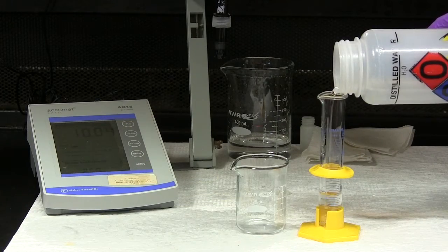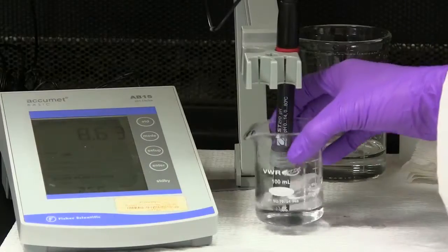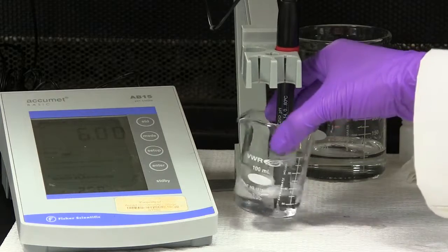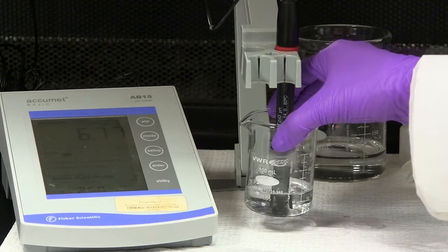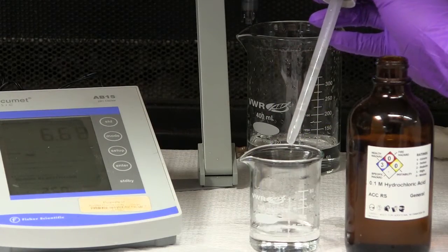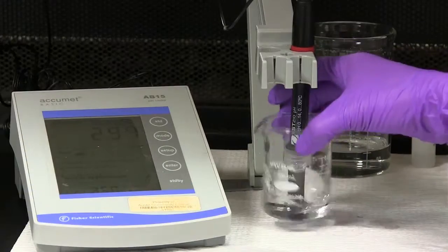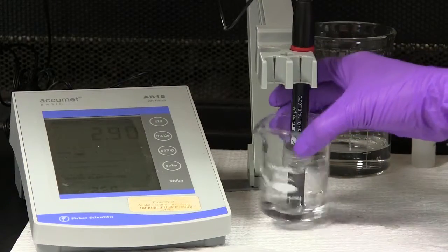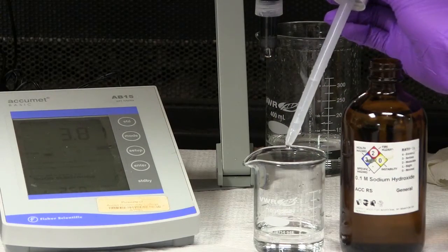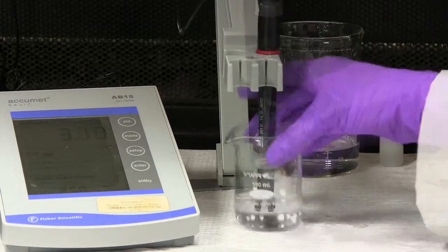Put 25 milliliters of distilled water into a 100 milliliter beaker. Measure the pH. Add 5 drops of 0.1 molar hydrochloric acid and measure the pH again. To that solution, add 10 drops of 0.1 molar NaOH. Mix and measure the pH.